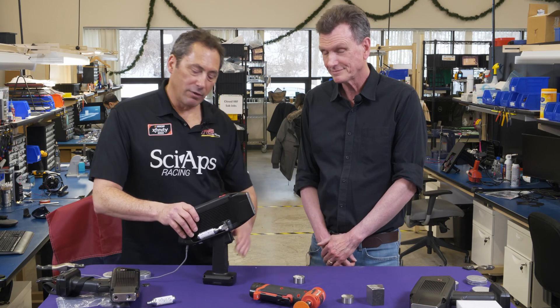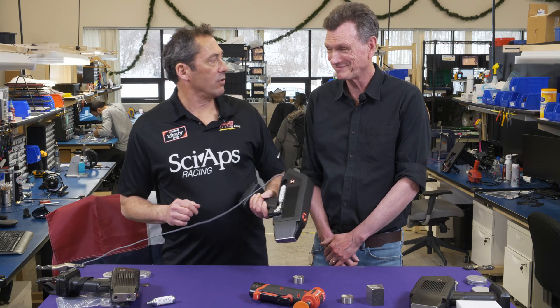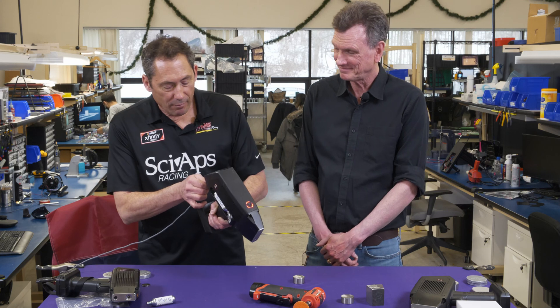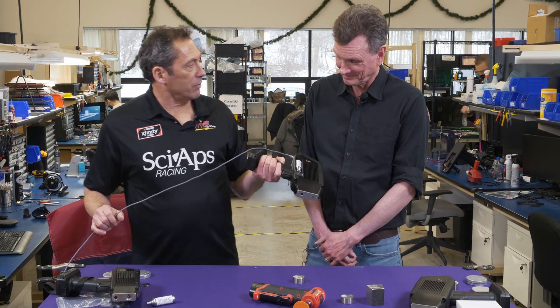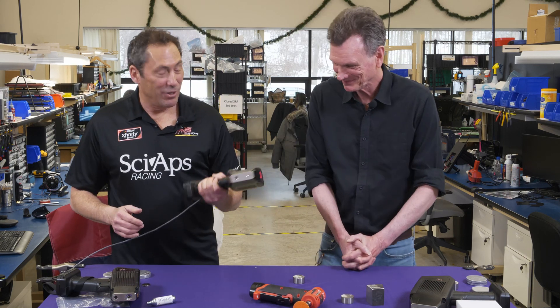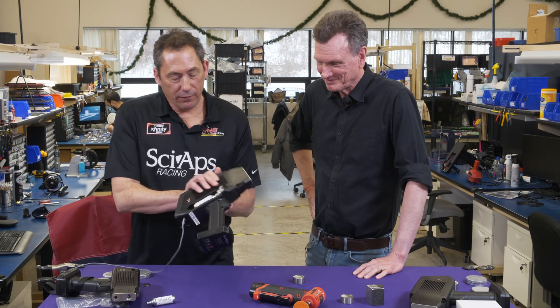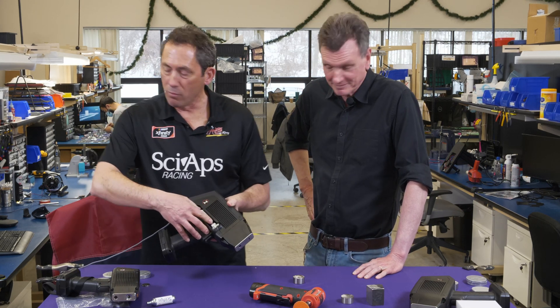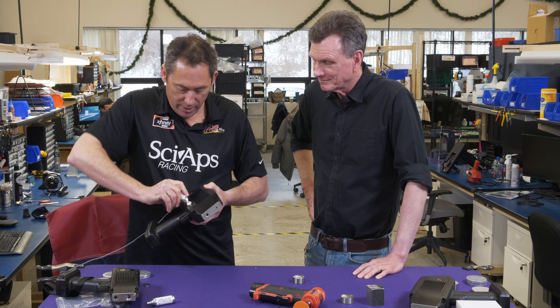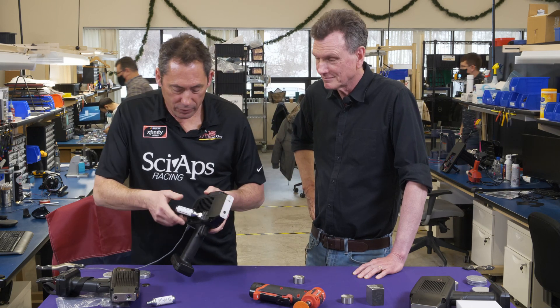So that's what we did. I went to the guru here and said: hey Dave, can we make a unit that only does carbon, sell it for less money, weighs less, is faster, and looks better? And this is the result of several of our efforts. Here's the unit — the first thing you might notice is the argon tank, and on the new model it's on the side.